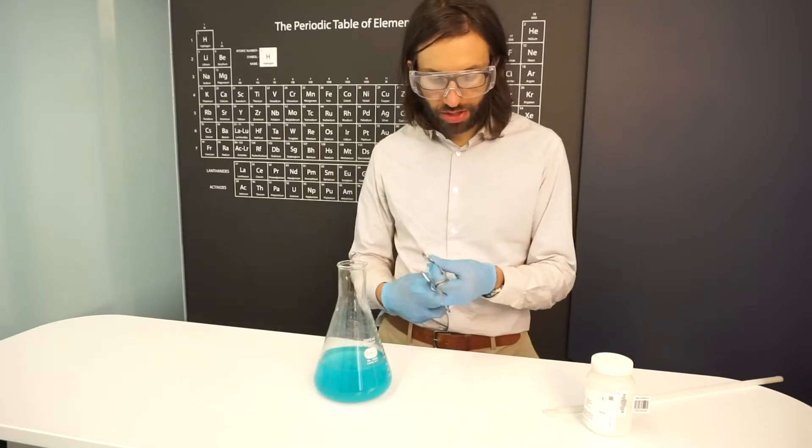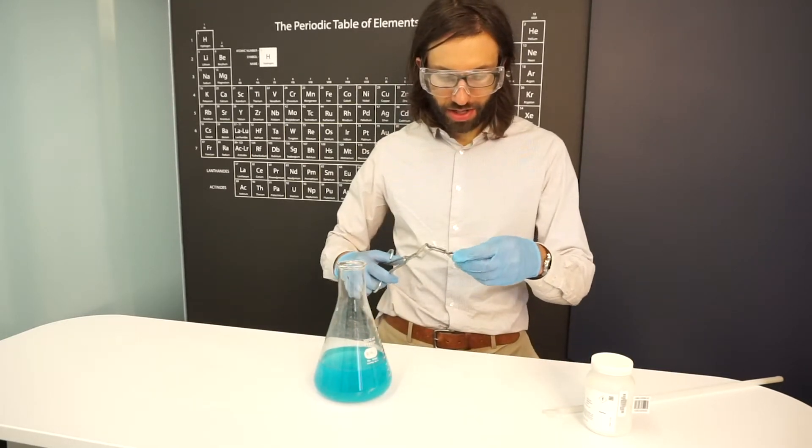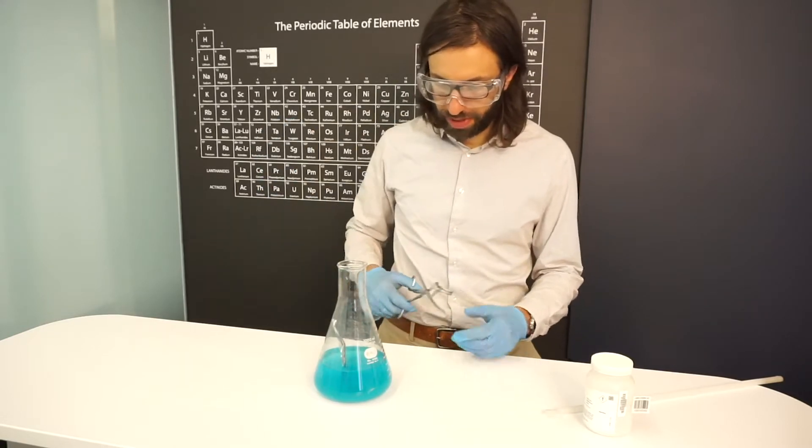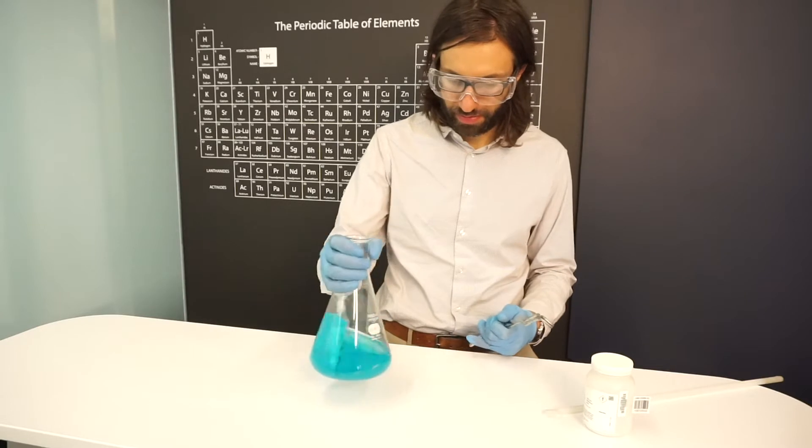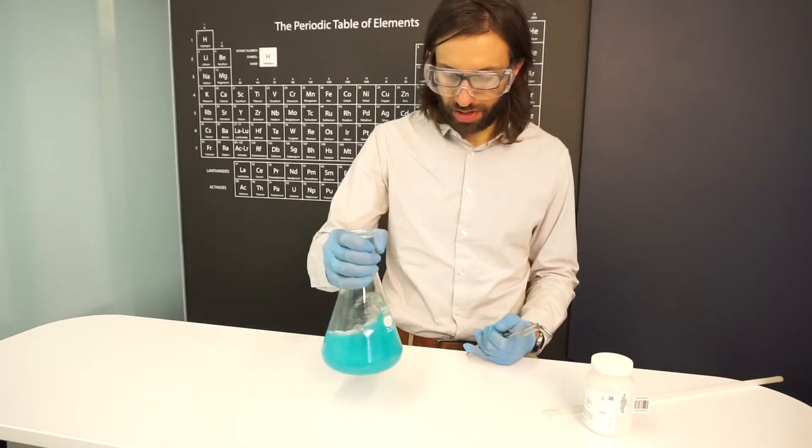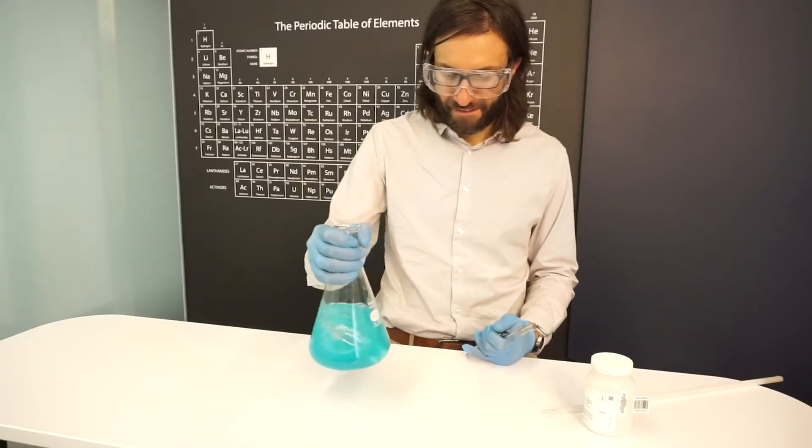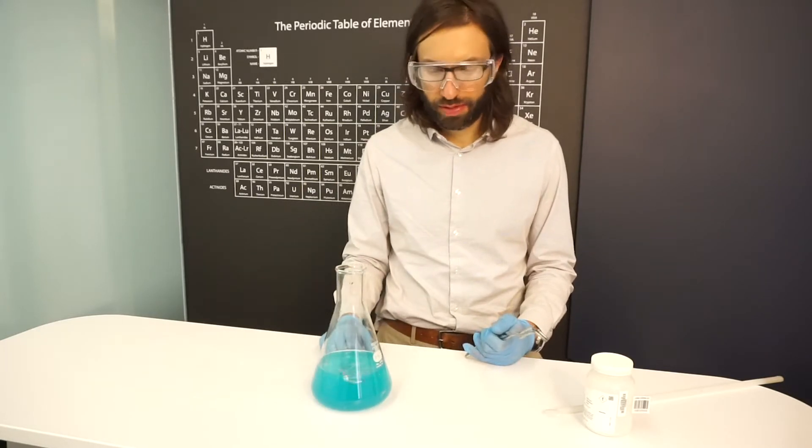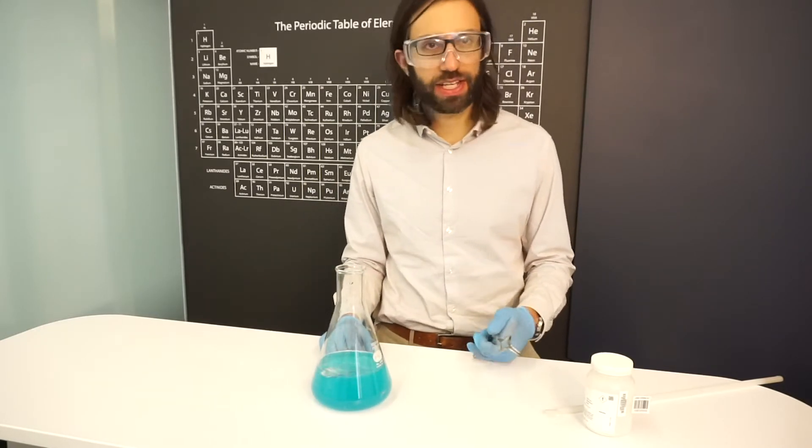And we're going to try to do a galvanic displacement reaction with aluminum foil. Put a piece of aluminum in there, swirl it around, and you can heat this up or wait all day, nothing's going to happen.